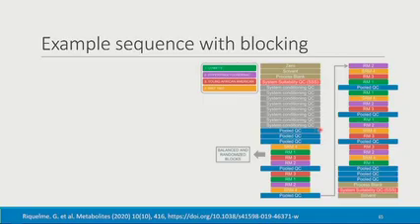We then run a few pooled QC samples at the beginning to get an idea of what the reproducibility is when we're running our actual samples. And then here we have our blocks. So I'll have block 1, block 2, block 3, 4, 5, and 6. And what you'll notice is in each one of these blocks, I have one sample representing each class. So here I have 4 classes of samples. In each one of these, I will have one of my samples from each one of these different classes.